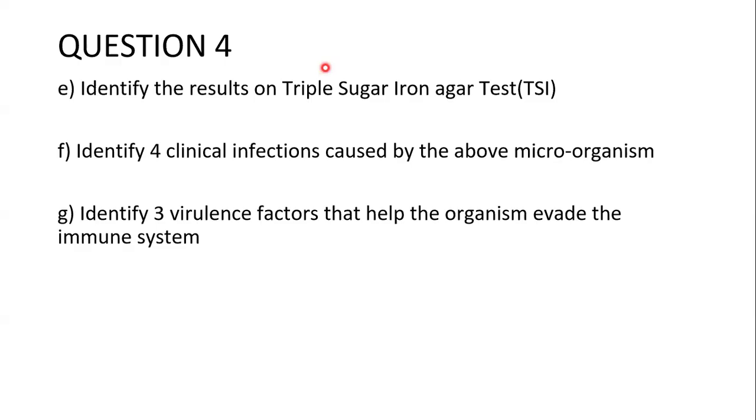Do you have one for oxidase positive? Who has one for oxidase positive? Can you share with us? Okay, I think if you can get it, you can just send it on the group.